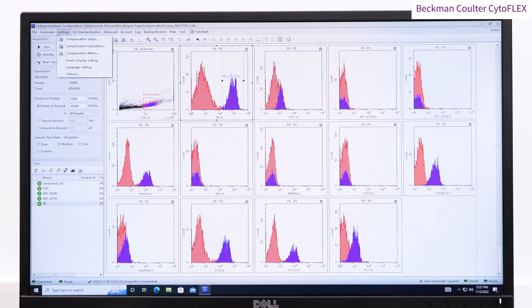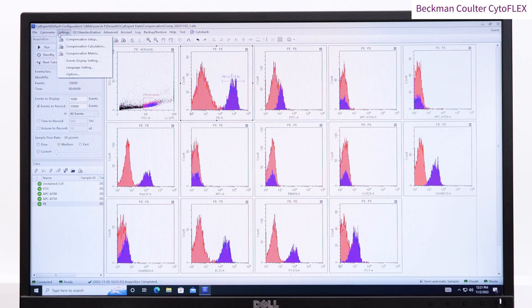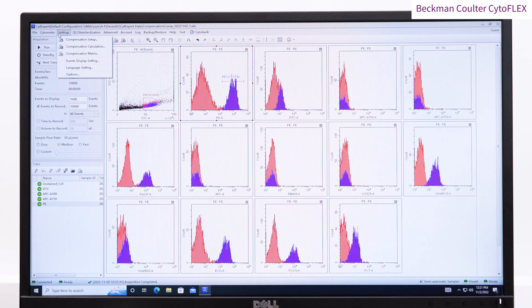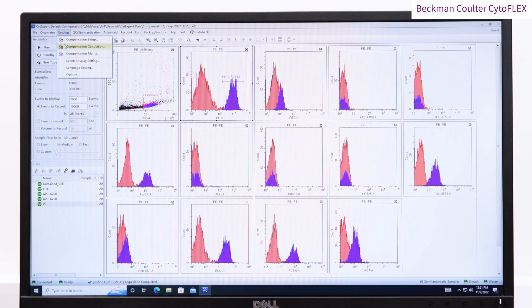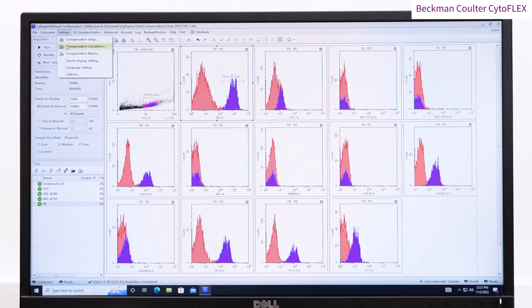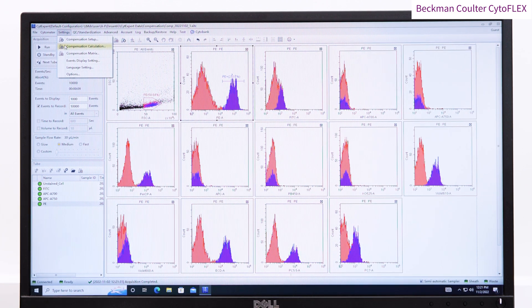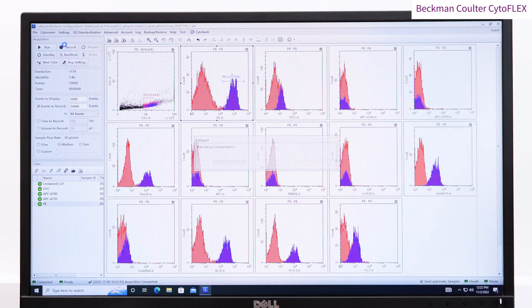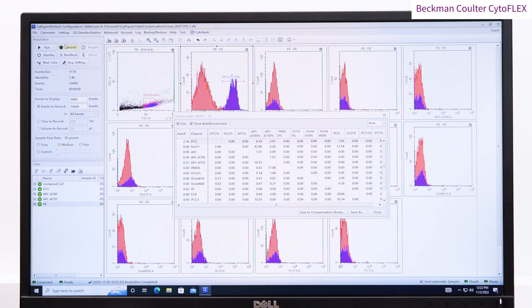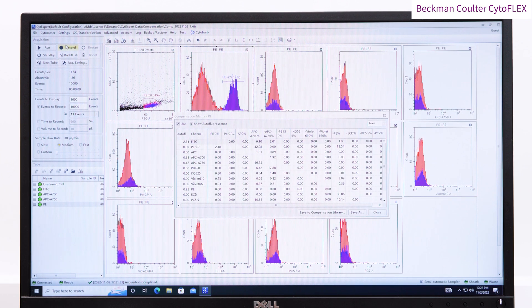In settings, choose Compensation Calculation. You can then save the compensation matrix into the library, in the software or to a file.